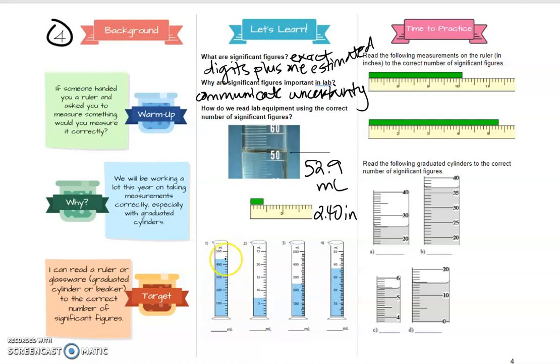I'm looking at this and I'm saying, okay, where do I think that meniscus is, that line at the bottom? Well, to me, that looks pretty darn close to that 440 number, but I think it's like a little below that line if I'm trying to draw in that line there. So maybe I think that's 439. Okay? Maybe you think it's 440 on the dot. Okay? Great. But you're telling me where you're estimating that.